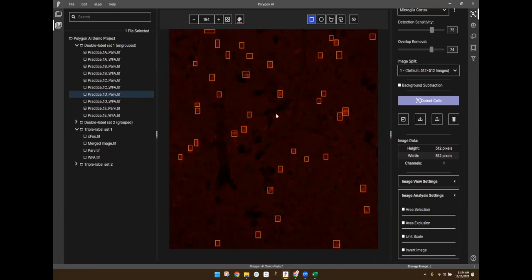Oh, great. One other thing I didn't mention earlier with the custom model training is that you want to make sure that the 5 or more example images that you use are representative of the variation that you're going to see in your data. It'll be more robust to that natural variation in that case. So don't pick 5 images that all look identical if you're expecting other kinds of variability in the rest of your data set, because it won't perform as well. I'll verbalize that one as well.